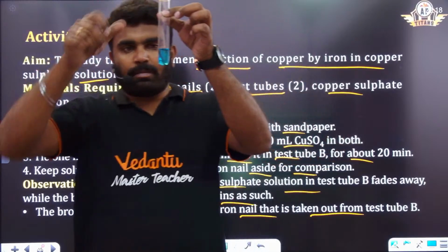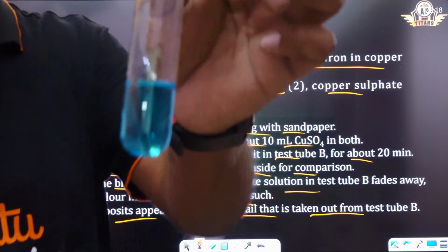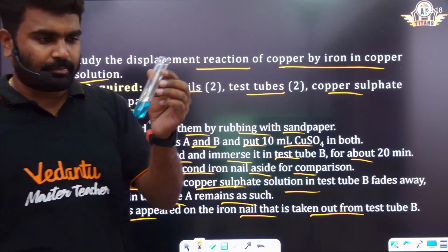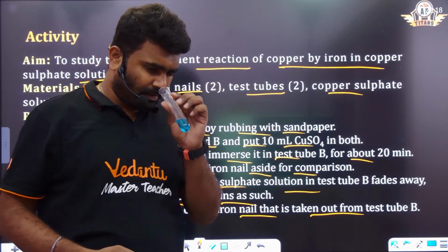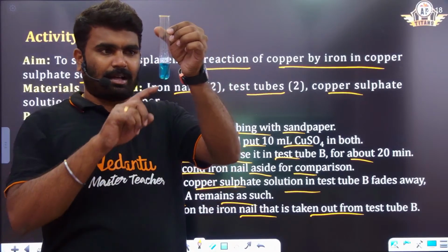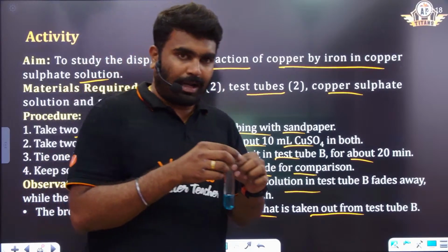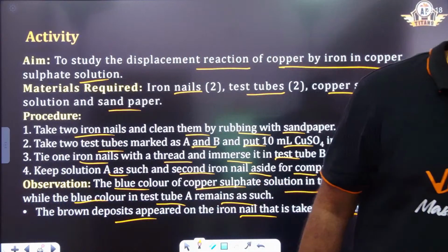So here you can observe the bubbles, right? You can observe the bubbles. And there is some change. We might observe the change here. So I'll show you after 2 to 3 minutes.